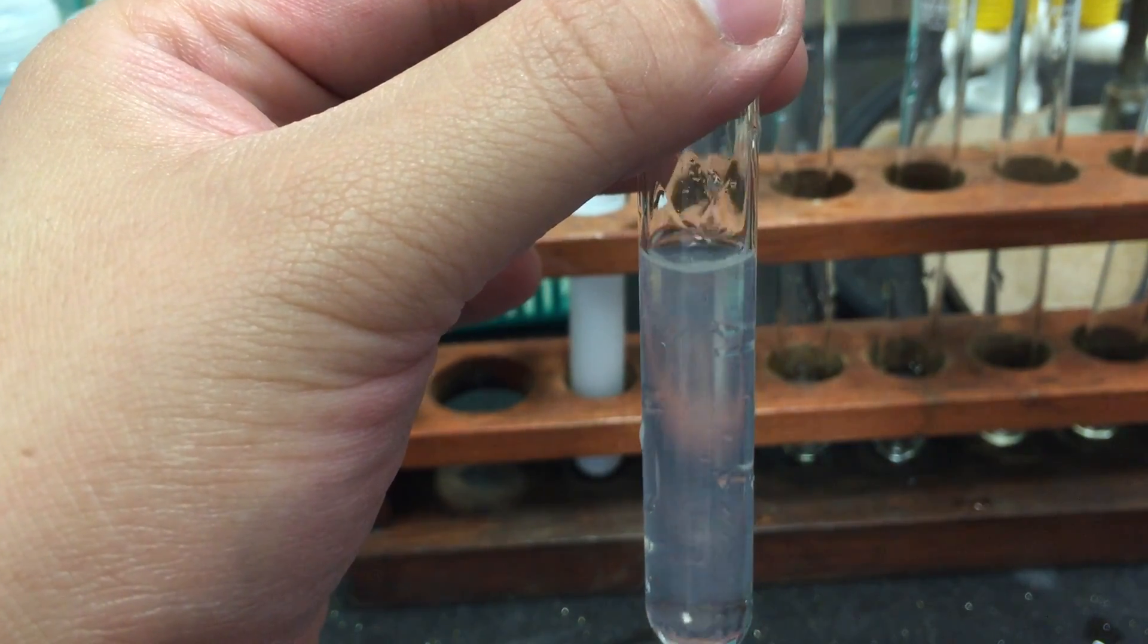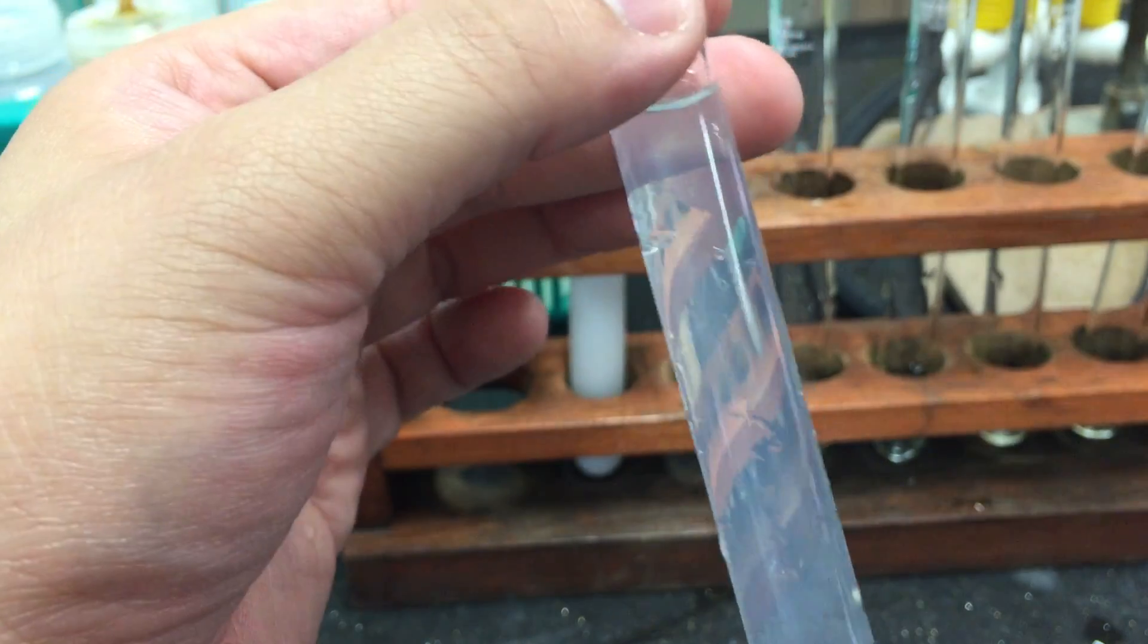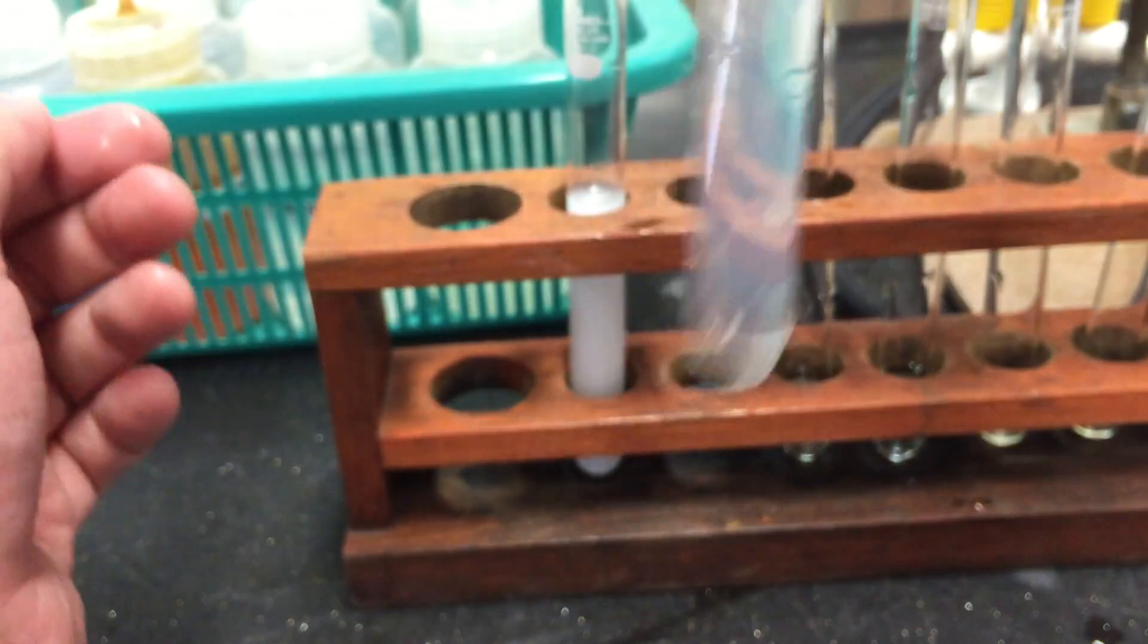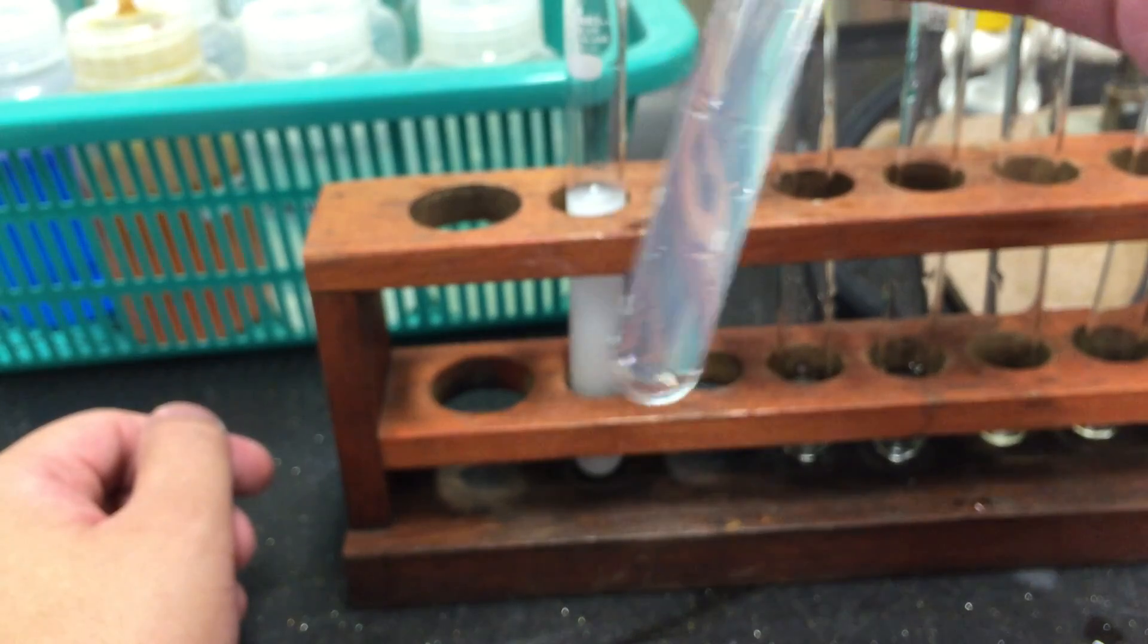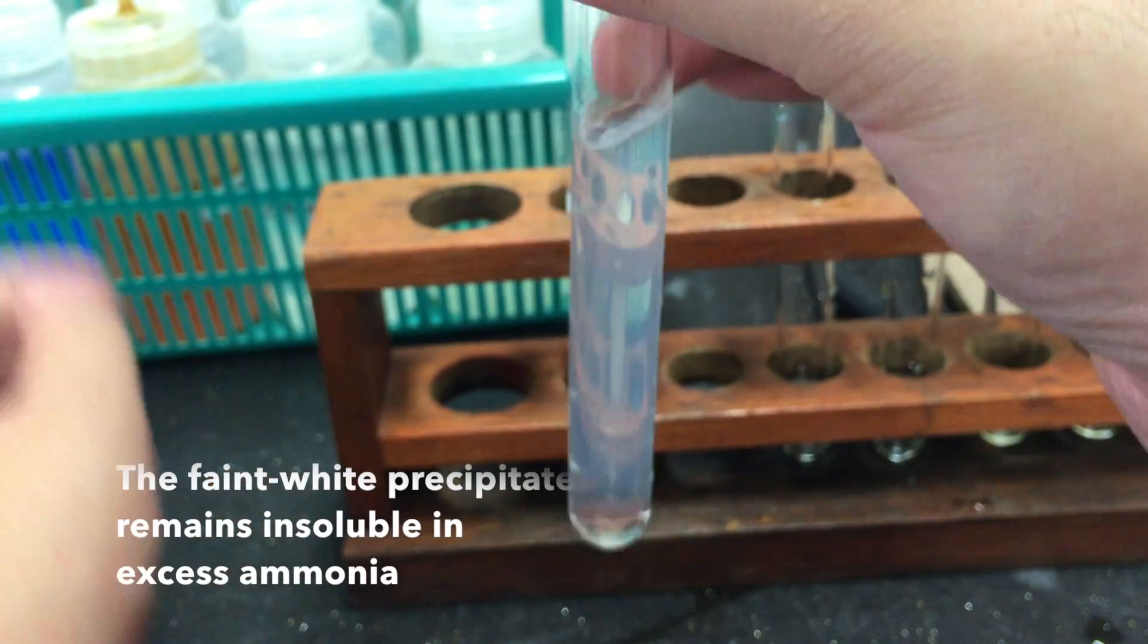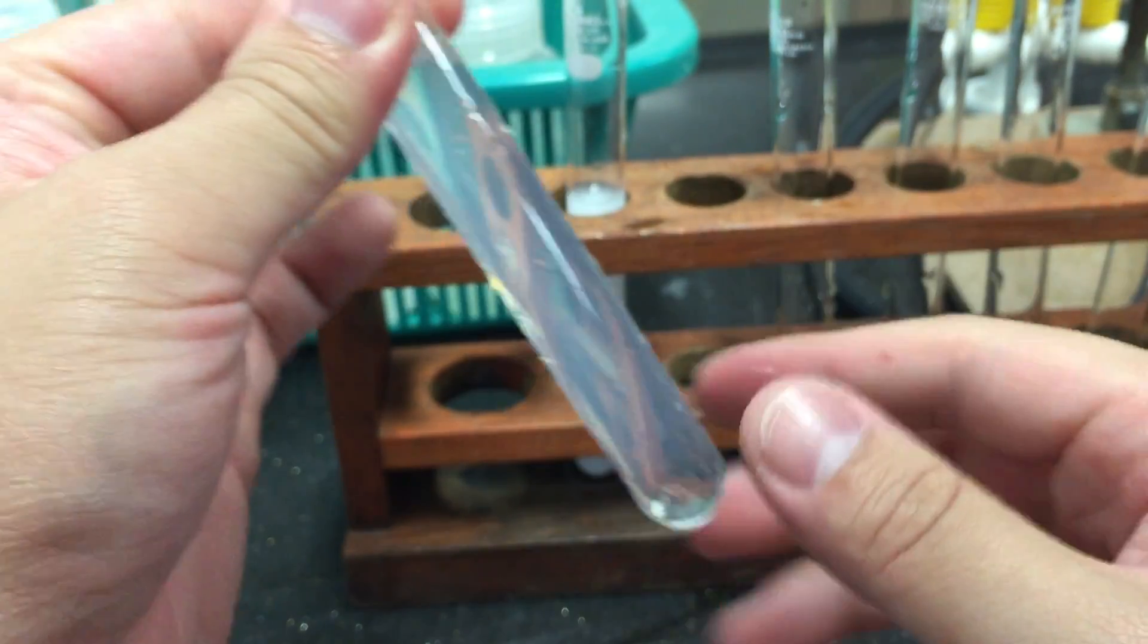We may proceed to add an excess of ammonia solution. Very clearly, the faint white precipitate remains insoluble in excess ammonia.